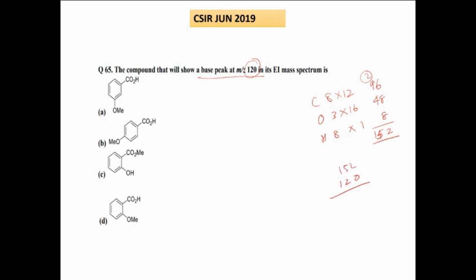So molecular ion peak லந்து molecule உடையுது, you get a daughter ion, you get an A, that is the base peak, A plus B வெளியே போகுது. So something is going out. Now B going out is, how much is going out? So இது 120, 32 வெளியே போகுது. So 32 னா என்னவா இருக்கலாம்?